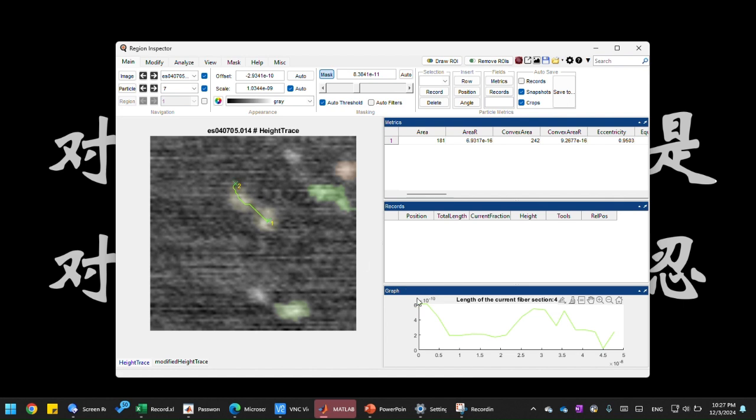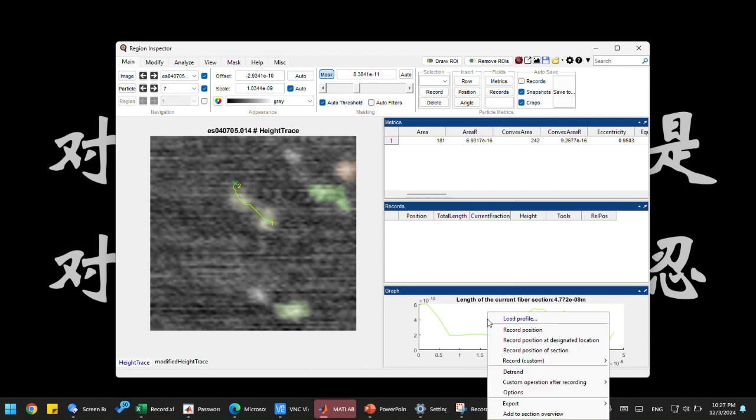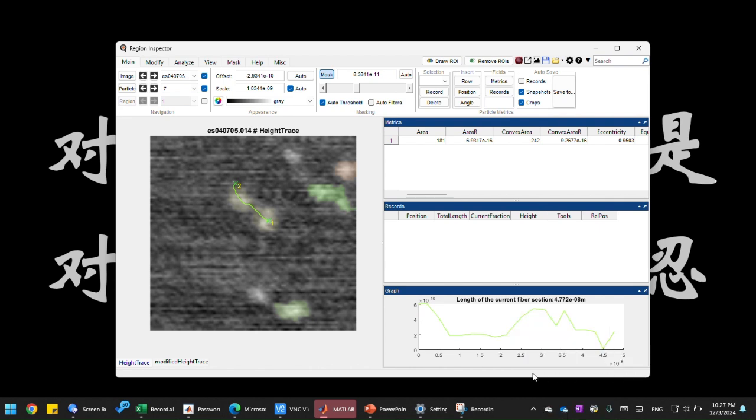And this can cause issues to the algorithm because it has a dip here, which can make the endpoint the peak more likely. And I would not like that. So in reality, if I chose record find peaks, it will find 3 peaks. So the endpoint is identified as a peak, right? And that's most likely because of the dip here in the middle, right? That's because of the noise, and also the endpoint really far extends outside the protein, right?